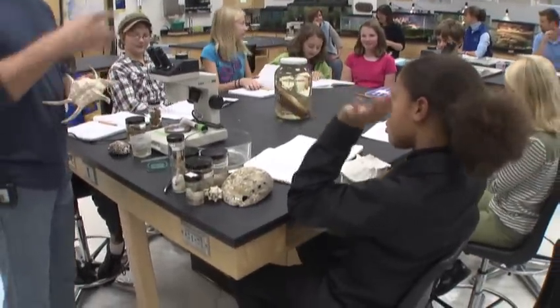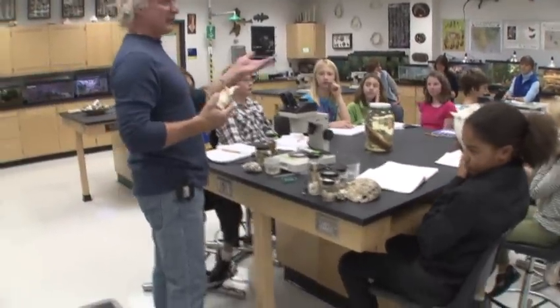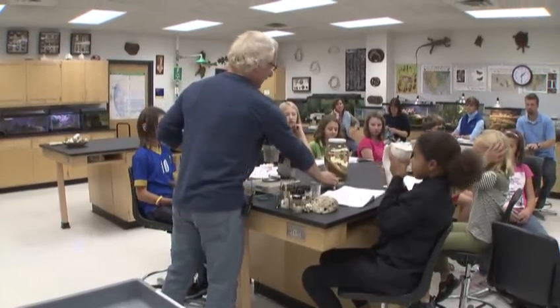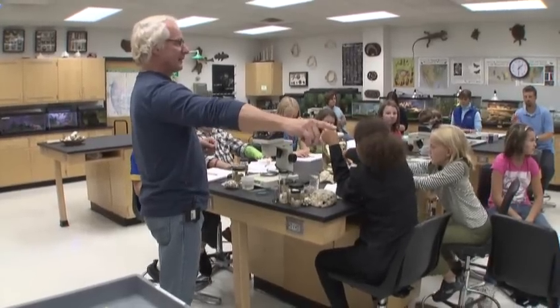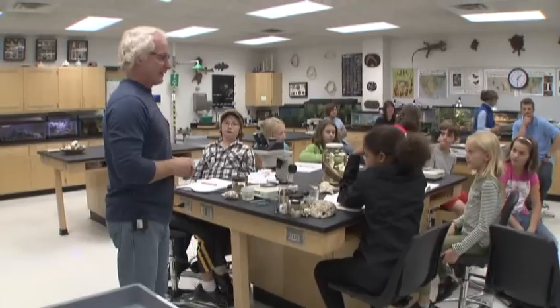All right, so let's go around to these tables here, and Courtney and Brad will help you, and I will help you look at these things. And then when we come back, we're going to do a clam dissection, and we're going to do a squid dissection. But I've got some clams I want to show you. Okay, so we'll just leave these here if you want to look at them. But you can challenge yourself by looking up some of these different mollusks in the book. I have one there, and there's others over here you can look at. And then we'll meet back here in a few minutes, okay?